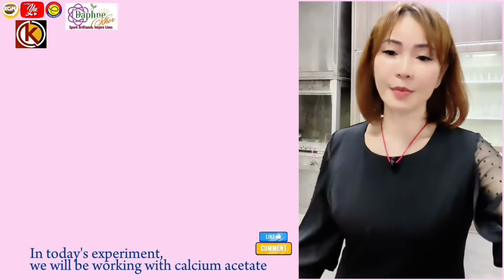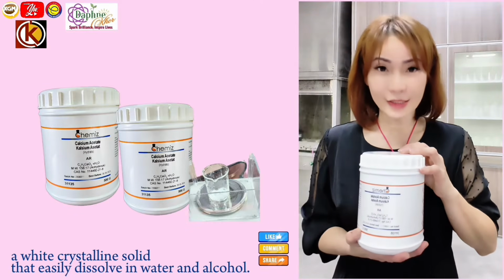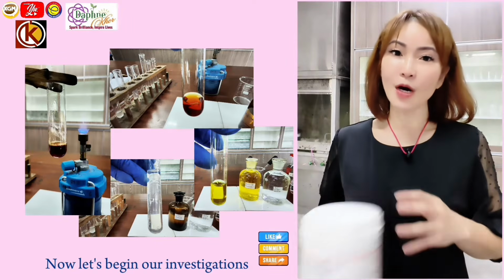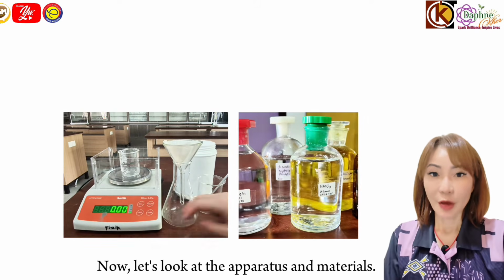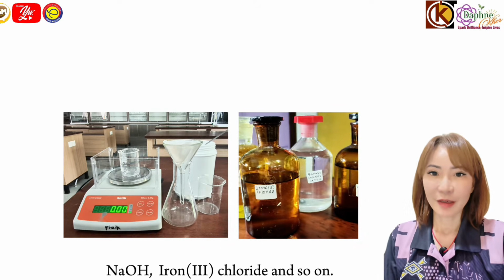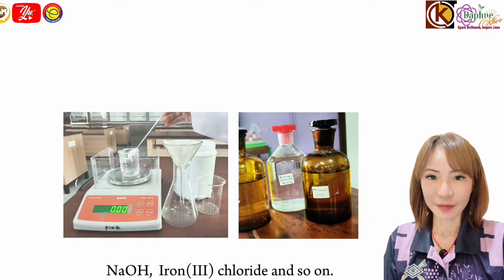In today's experiment, we will be working with calcium acetate, a white crystallized solid that easily dissolves in water and alcohol. Now, let's begin our investigations. Let's look at the apparatus and the materials. For the reagents, we have hydrochloric acid, NaOH, iron trichloride, and so on.